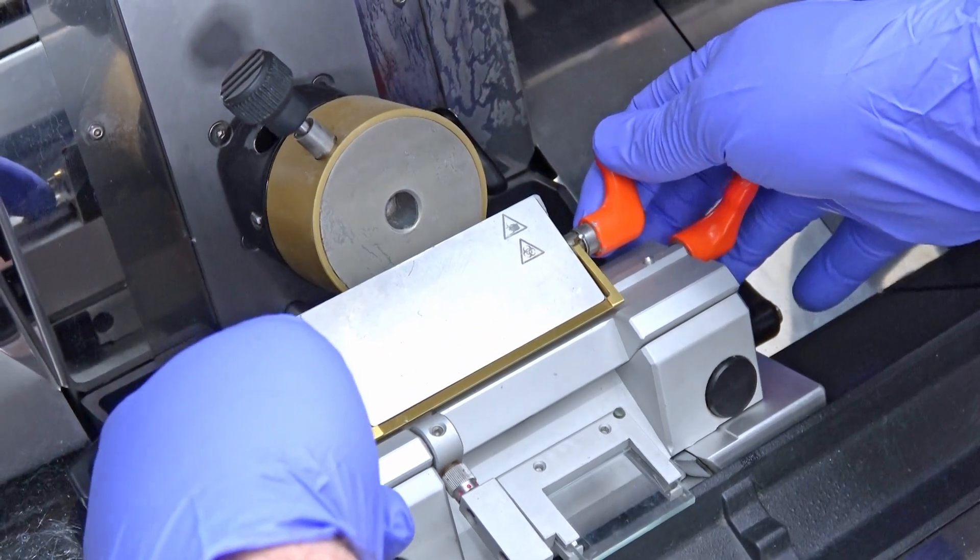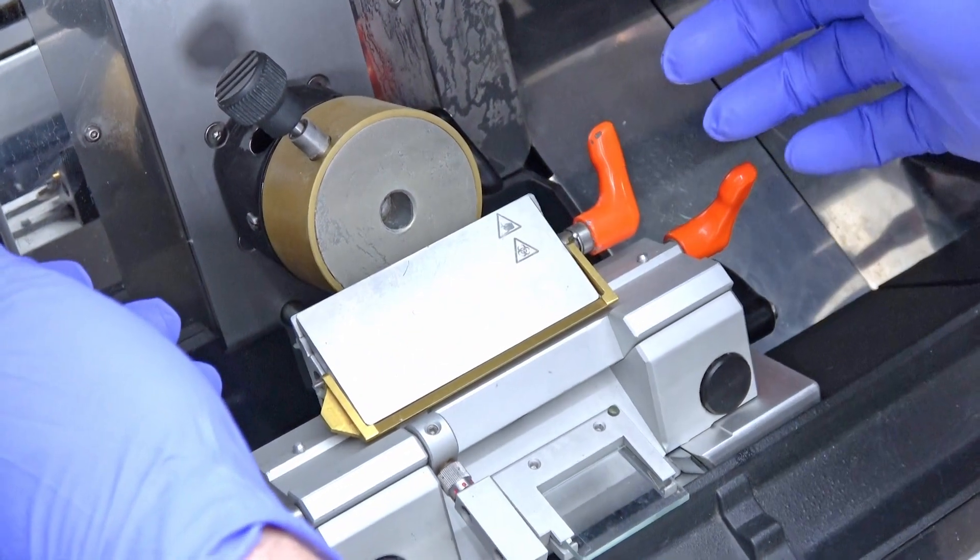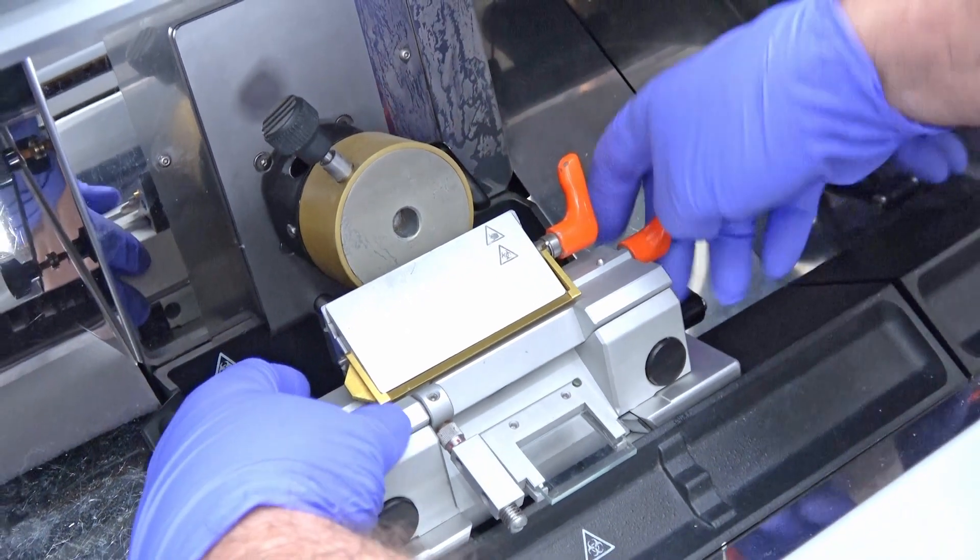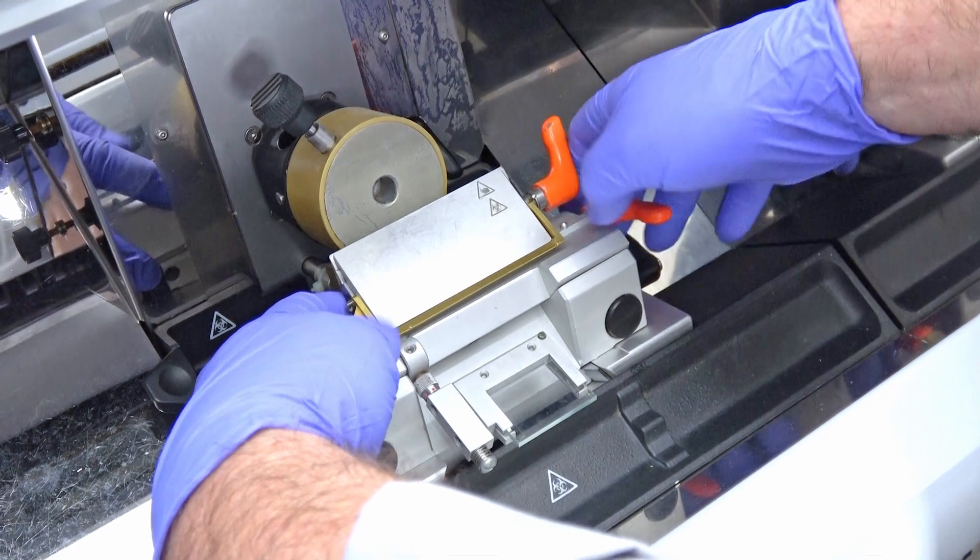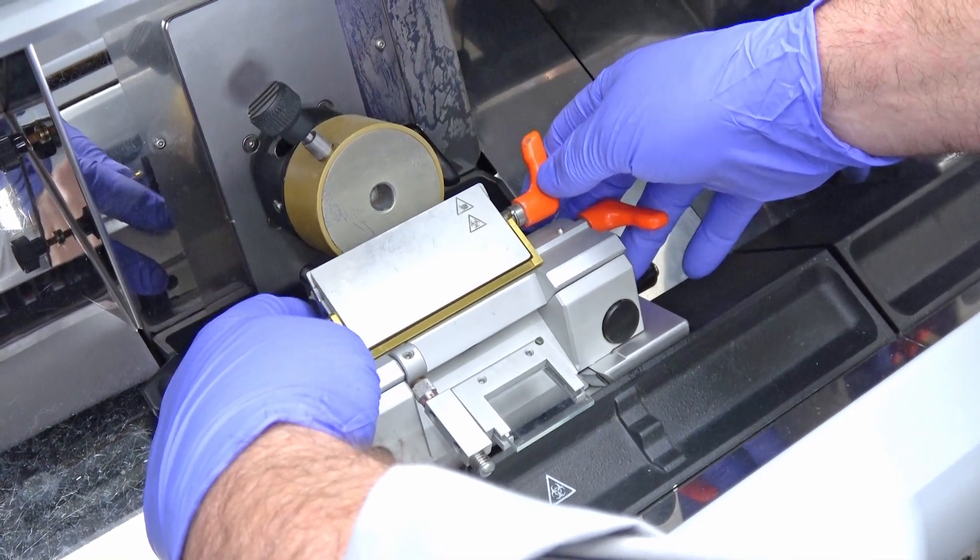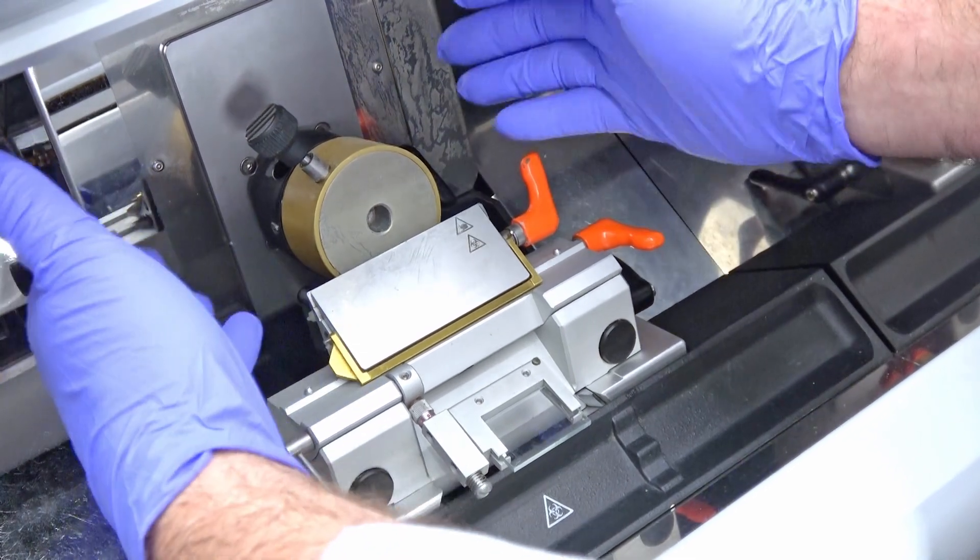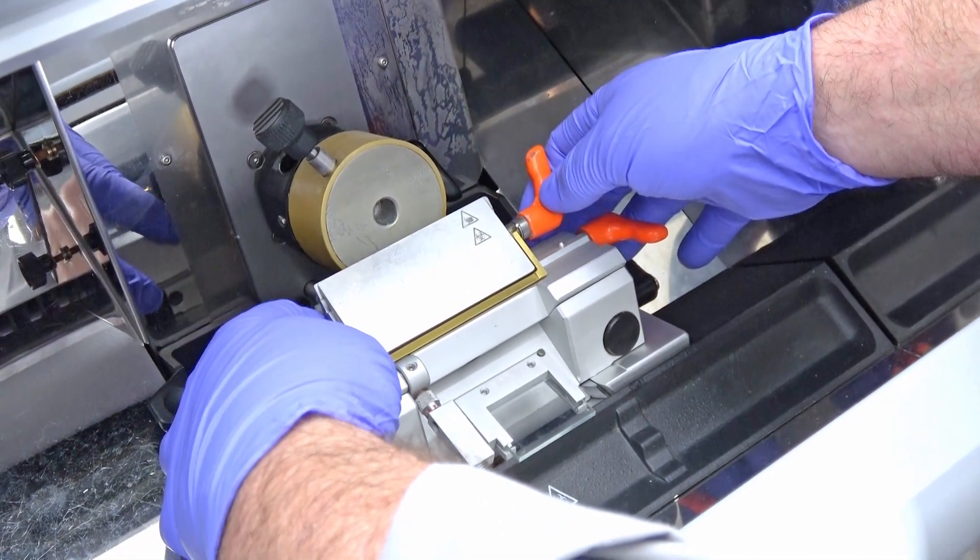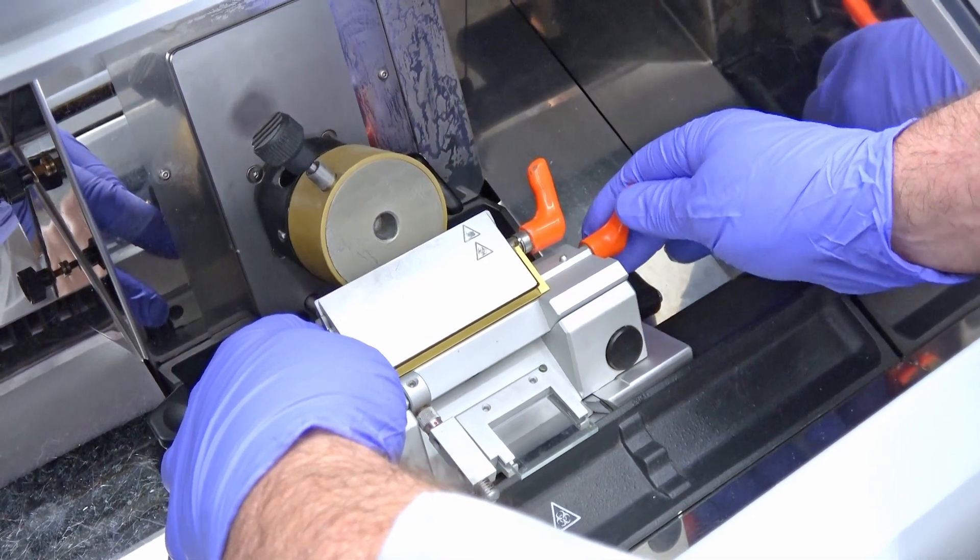This clamps the blade here. By loosening the other knob you can slide the whole blade back and forth, which is usually not necessary because this one's got the wide knife, so centering it with the cutting head usually does it.